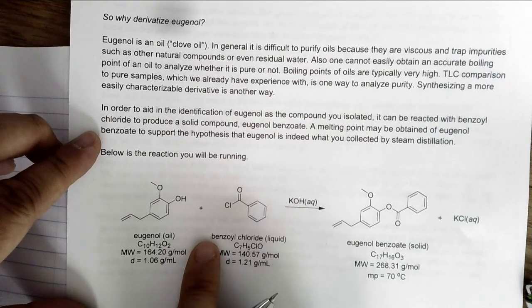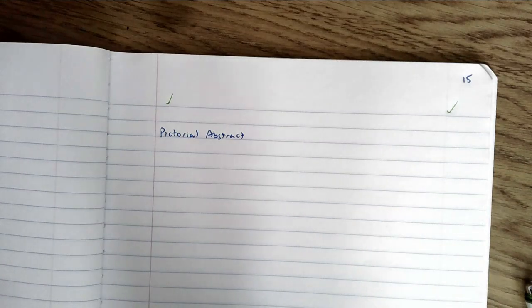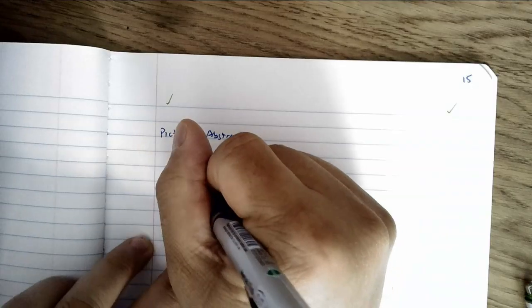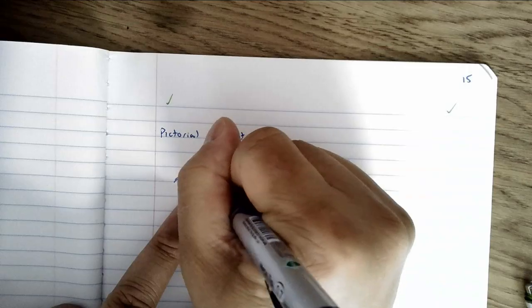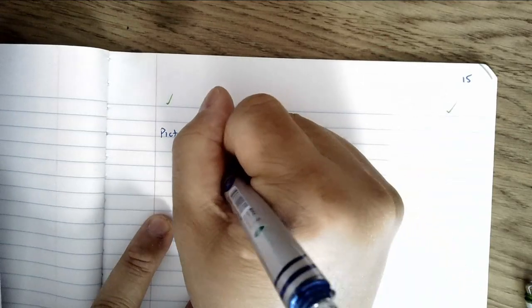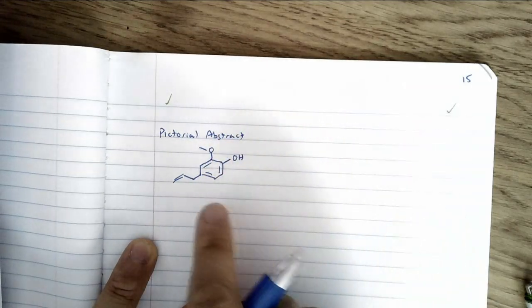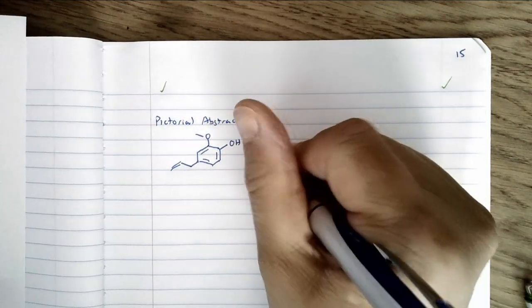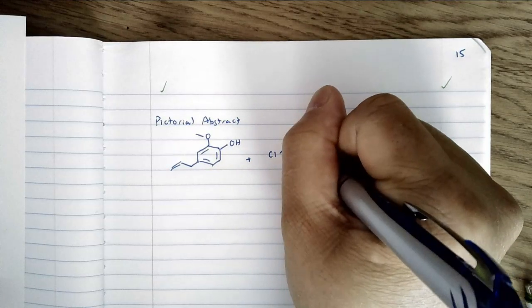That's the reaction here, so you are drawing that. Okay, I'll draw it out because I want to show you where to put the theoretical yield. It doesn't have to be neat. Definitely don't erase mistakes, just cross it out. This is the eugenol clove oil that you isolated, hopefully. And then we're going to react it with what's called benzoyl chloride.